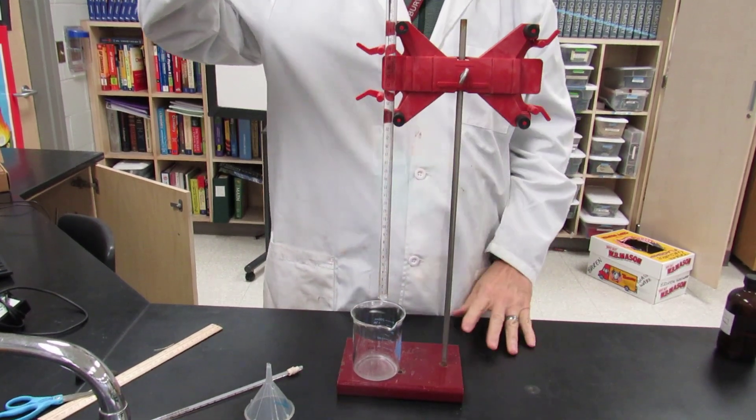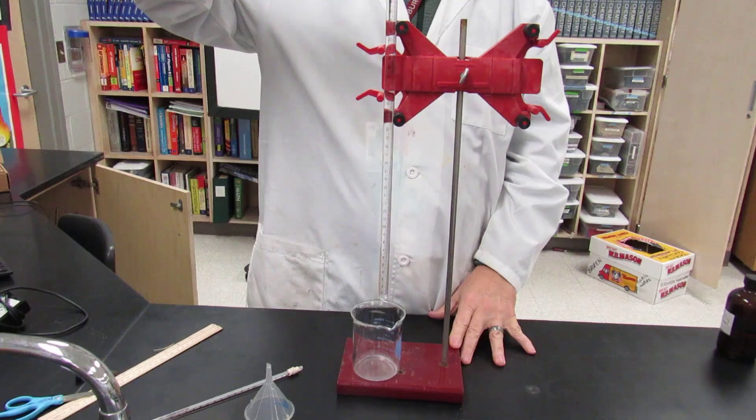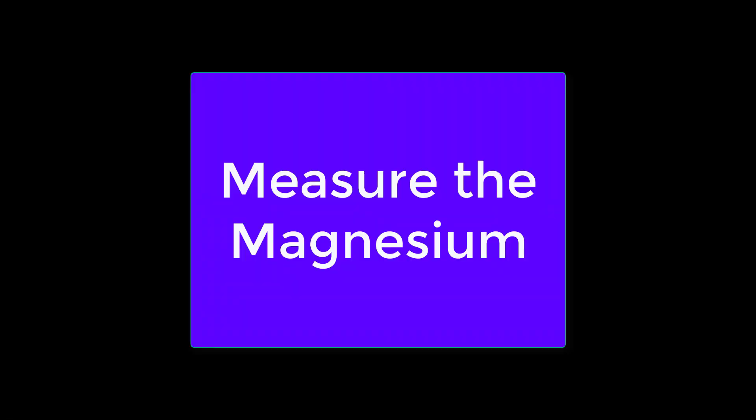Hydrochloric acid is slightly more dense and will stay at the bottom, but if you mix it too hard it won't. You fill it until you get a surface tension bubble. That's the surface tension bubble, it's got a little fill.